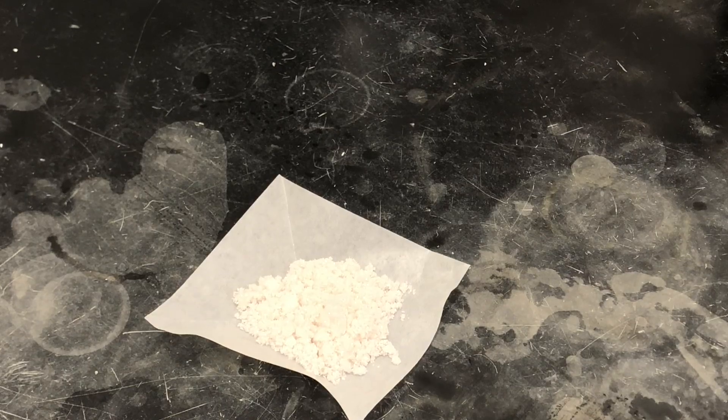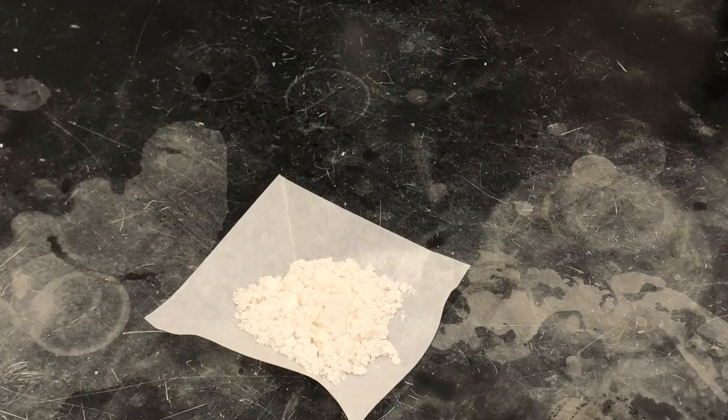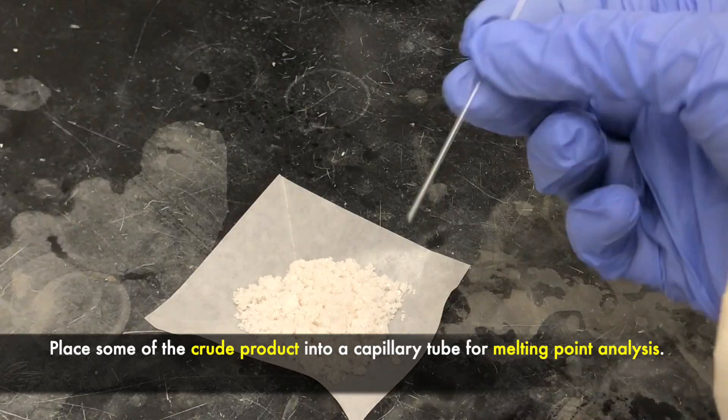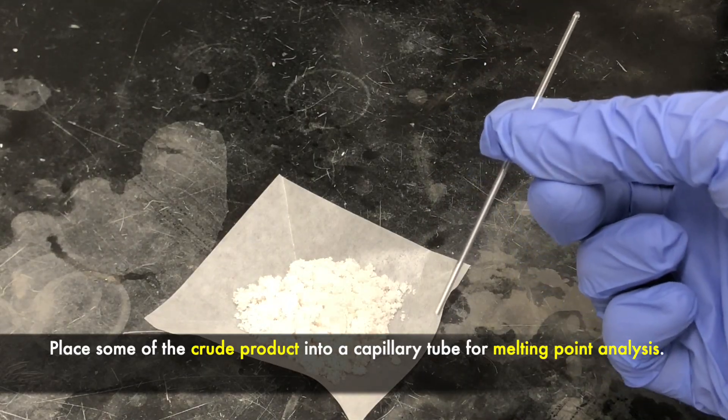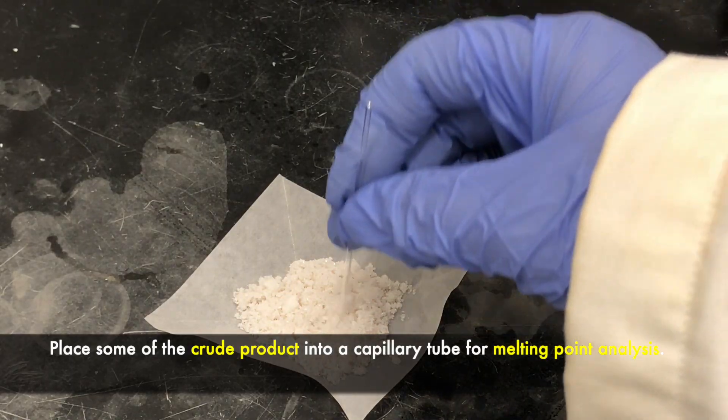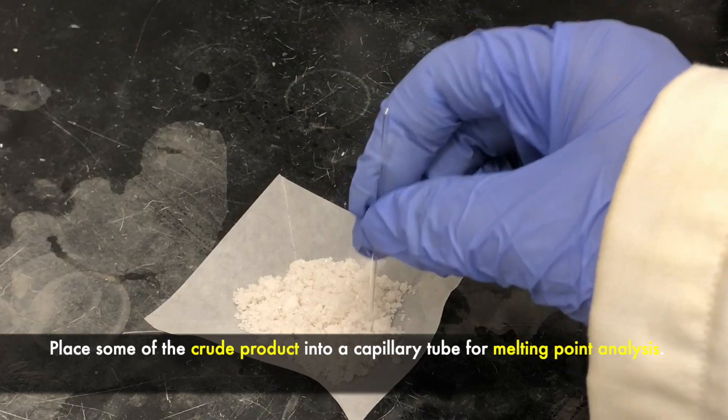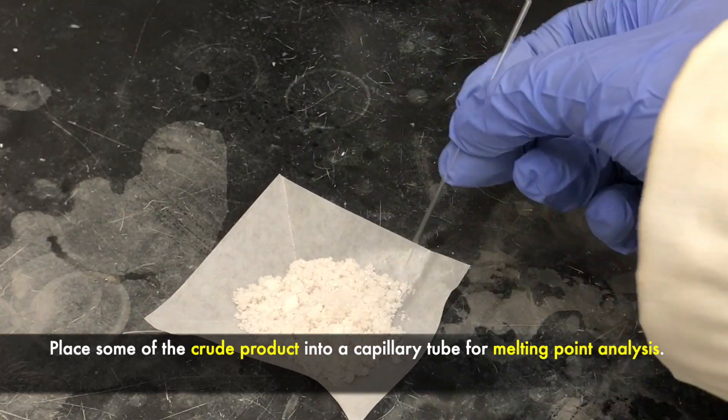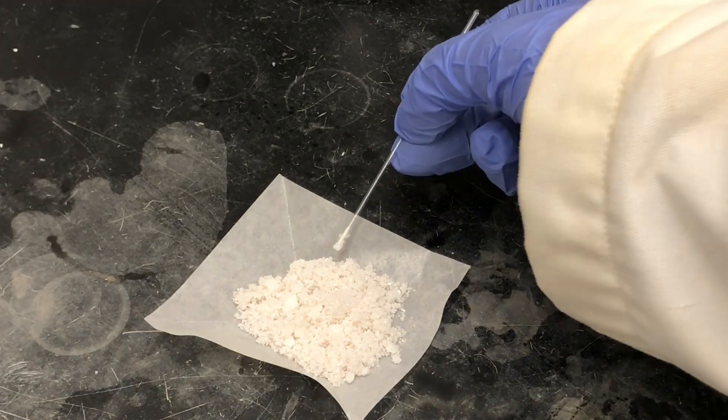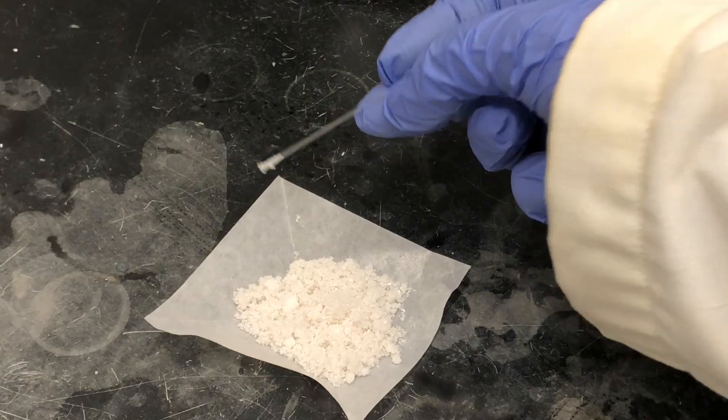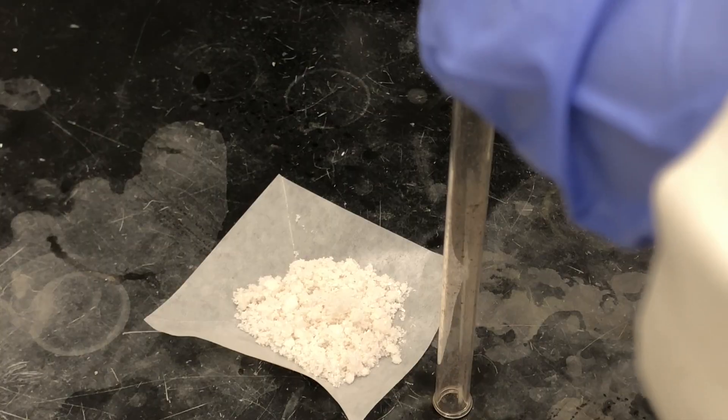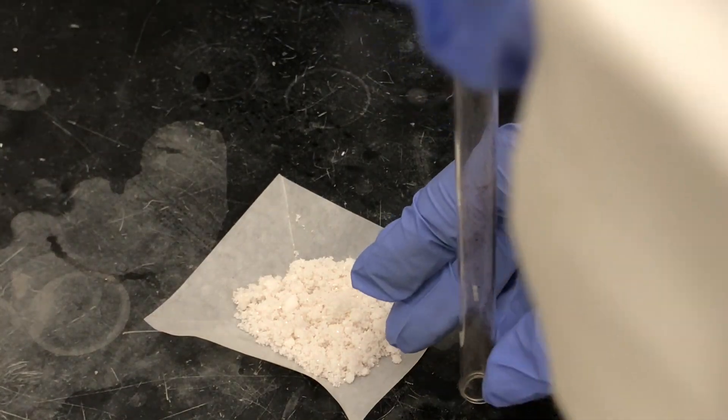Before recrystallizing the crude product, which has a slight tint of a pink color, what we'll do is place some of the crude product in a capillary melting point tube so that later we can characterize it. All we need to do is gently tap the capillary tube into the product until it fills about 2 to 3 millimeters, and then we'll place it in this hollow tube to allow the product to move from one end of the capillary tube to the other.